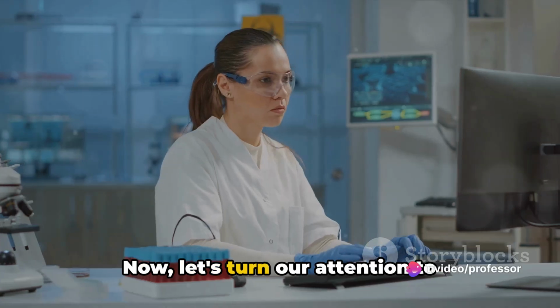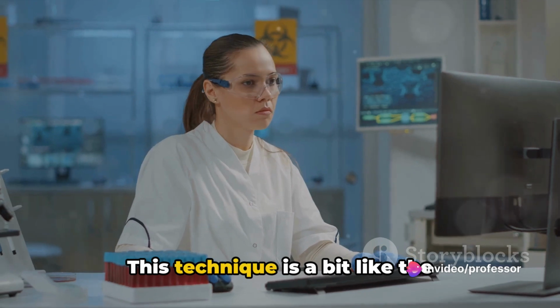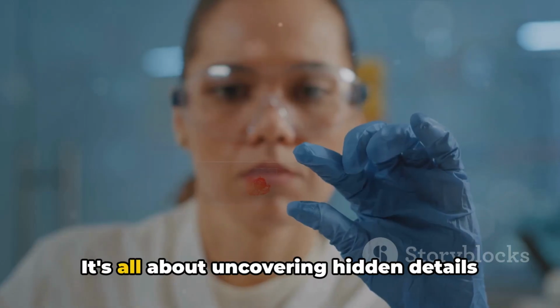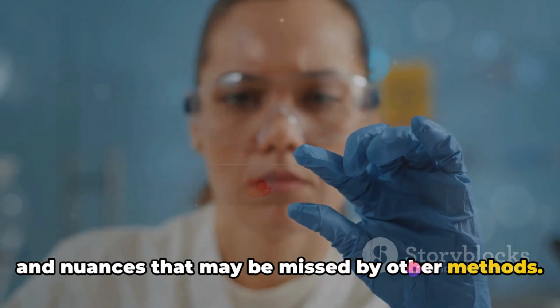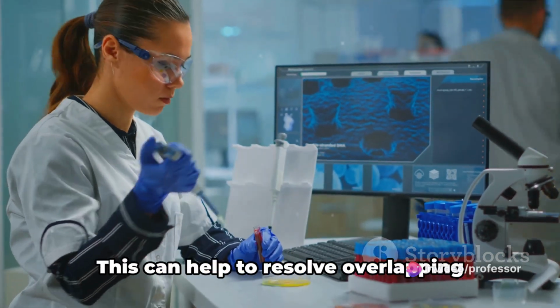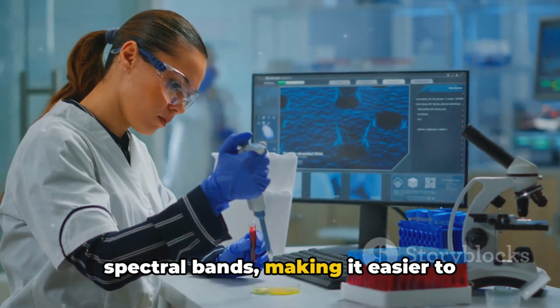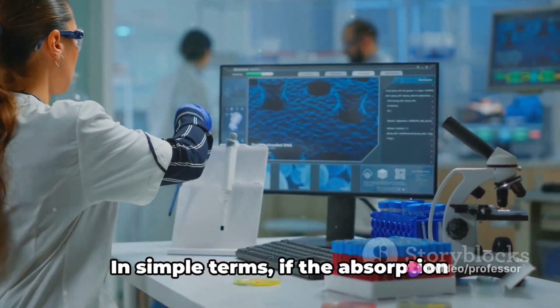Now, let's turn our attention to derivative spectrophotometry. This technique is a bit like the detective of the spectrophotometry world. It's all about uncovering hidden details and nuances that may be missed by other methods. Derivative spectrophotometry involves taking the derivative of the absorption spectrum. This can help to resolve overlapping spectral bands, making it easier to identify and quantify different components within a mixture.